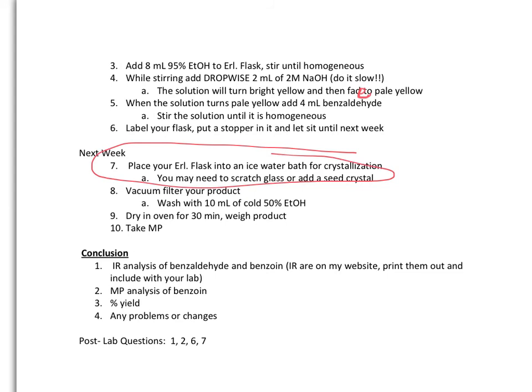So the little hint that I gave you: your color at the time of mix should have a hint of golden yellow, but it should not be like a caramelized brown type of color. But when you come in next week, since it would be ready and would have crystallized, we would simply go ahead and vacuum our system.